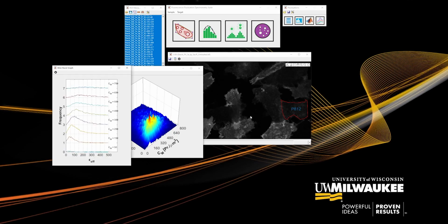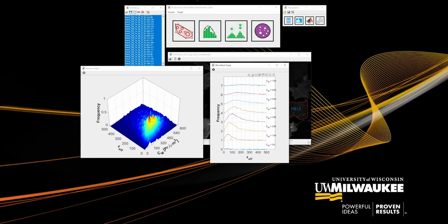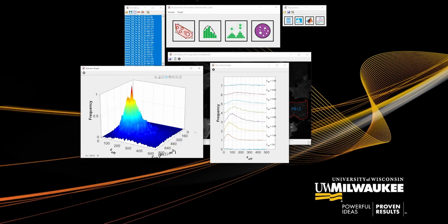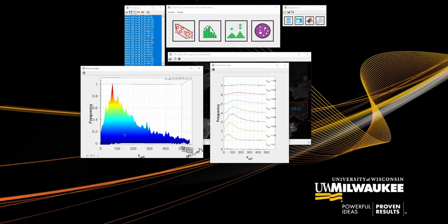The wire stack graph is generated by the cross sections of the volcano graph, separated by concentration. When viewing the plot from the side, each wire stack is generated by gathering the profile of the volcano graph at each concentration range.